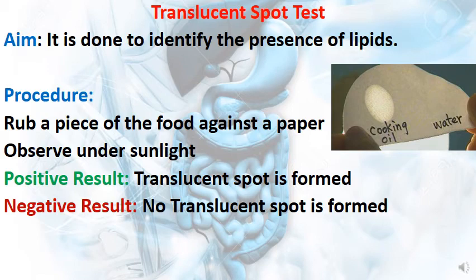Mainly it occurs whenever you are eating manoushi and more specifically za'atar. This manoushi that contains za'atar contains oil. So whenever you see this, the paper will have spots like this. If you observe it under the sunlight, it will be a translucent spot. It allows a small amount of light to enter through it.